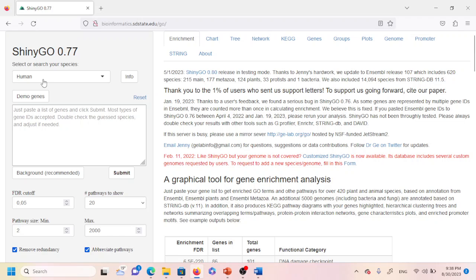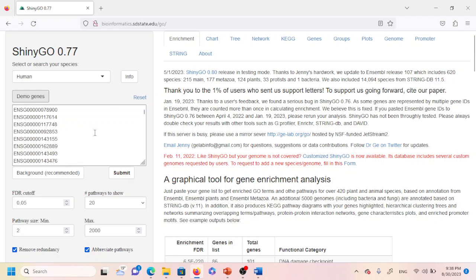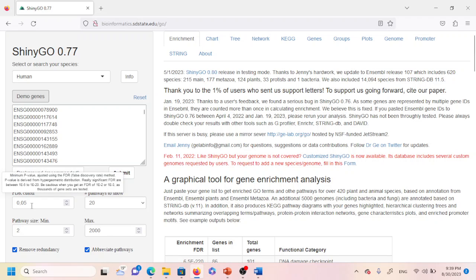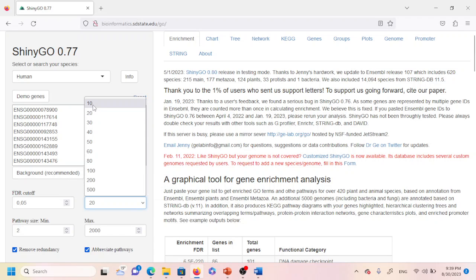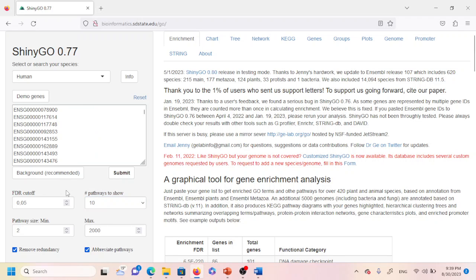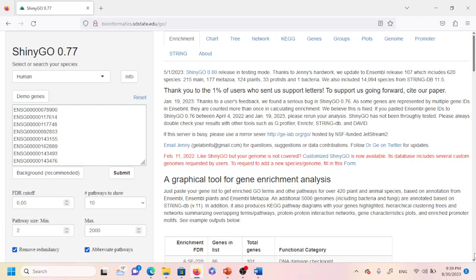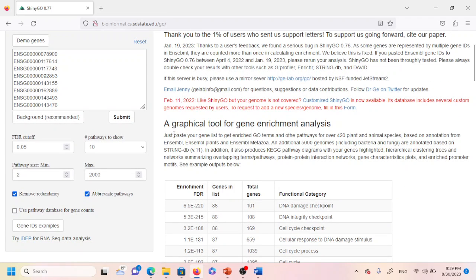I'm going to paste the list of gene IDs — I'll select the demo genes to show an example. Here we have the FDR cutoff, which you can adjust; the default is 0.05. You can also set how many pathways to show — it defaults to 20, but I'll set it to 10. You can also adjust the pathway size from 2 to 2000. After setting all these parameters, click submit.